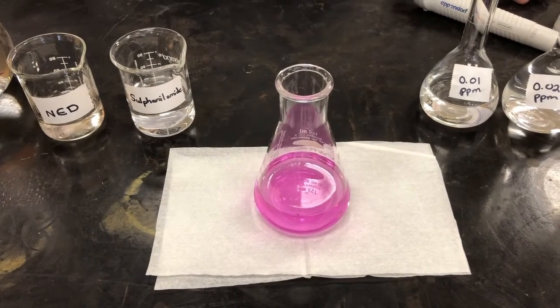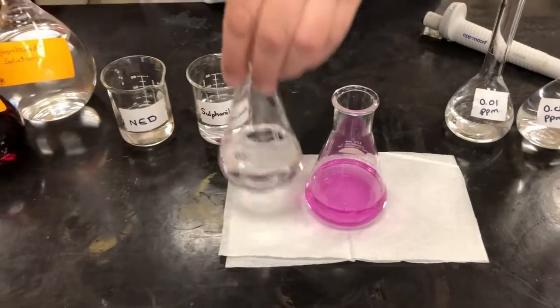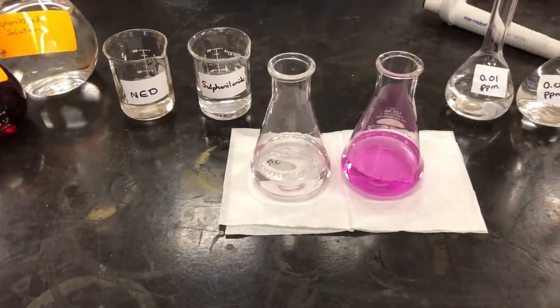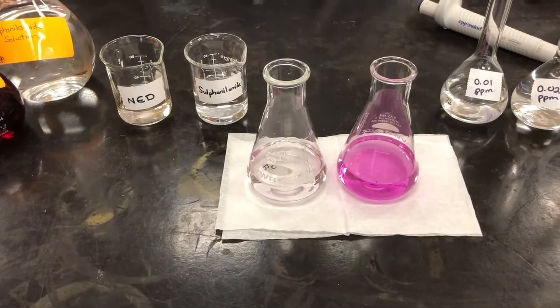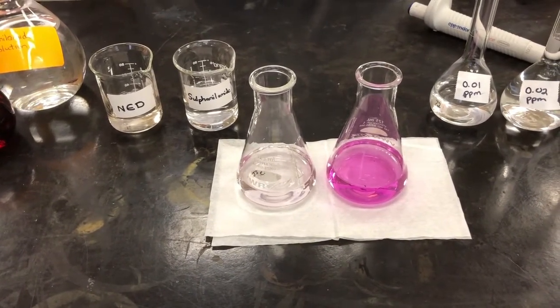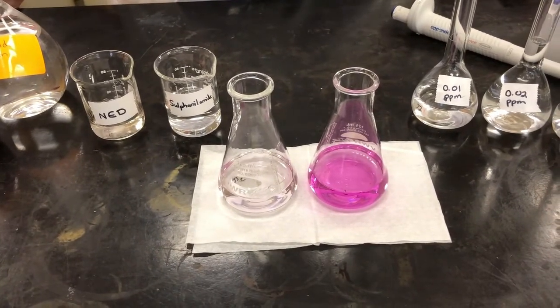So the color for the other standards will vary from that light pink that we started with all the way up to the bright pink. The concentration of nitrites will increase with the concentration of the color. We're going to measure those on the spectrophotometer, and you will see how the absorbance changes with the intensity of color as well.